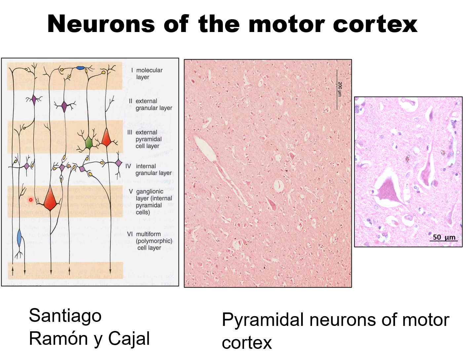In the sensory cortex, these motor neurons or the pyramidal neurons are less in number, and these granule cells are more in number. In the motor cortex, the pyramidal cells are more in number and the granular cells are less in number.